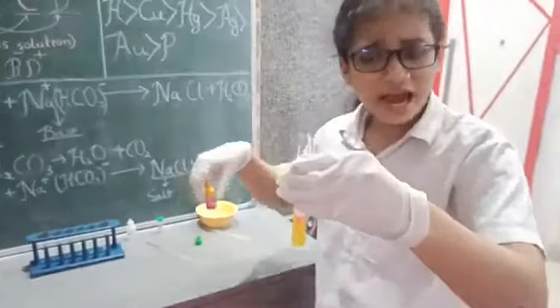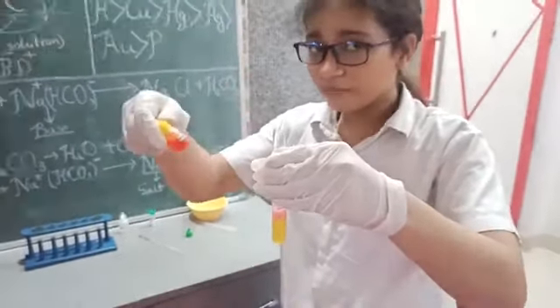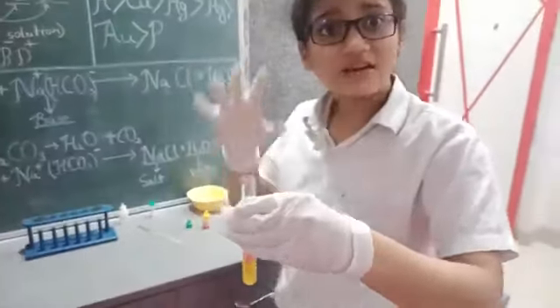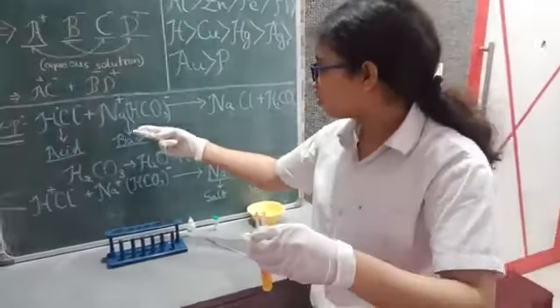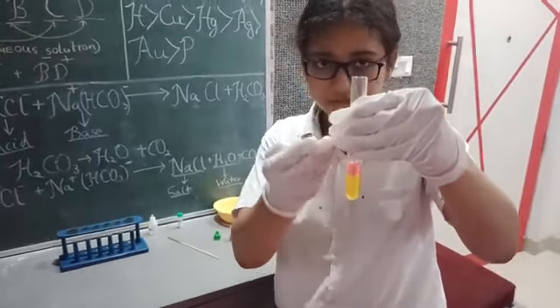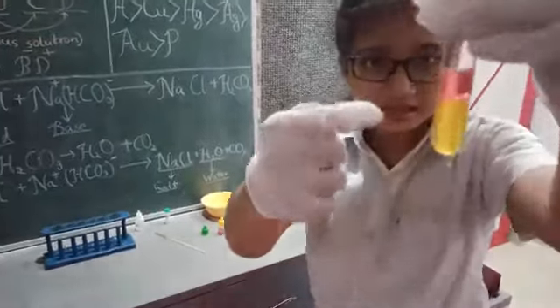Now you may know that when methyl orange is in its neutral form, it is an orangish color, as you can see over here. So now we can conclude that the hydrochloric acid and the sodium bicarbonate, since the acid and base are neutralizing each other, that is why it's creating an orangish tint. And CO2 over here is a byproduct. As you can see, there are little bubbles coming up.